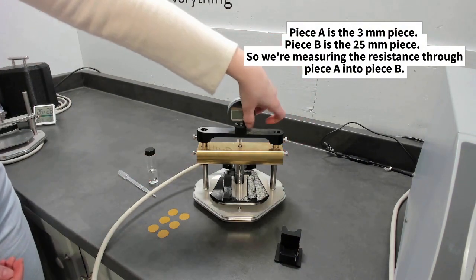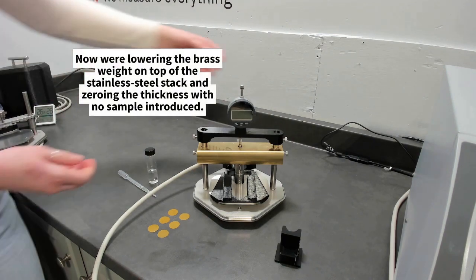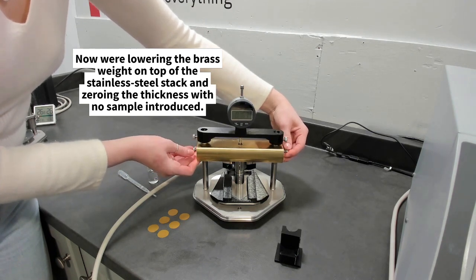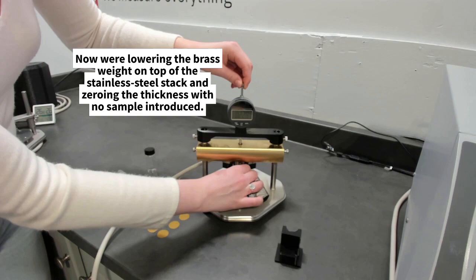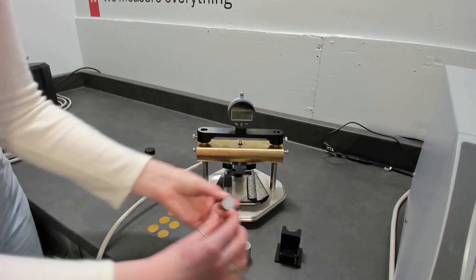Here we're applying our standard weight and zeroing the thickness because there's no sample introduced just yet. We run this as our first step to zero the thickness and disassemble it.